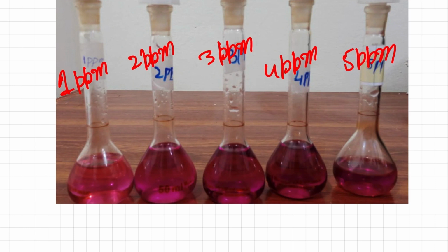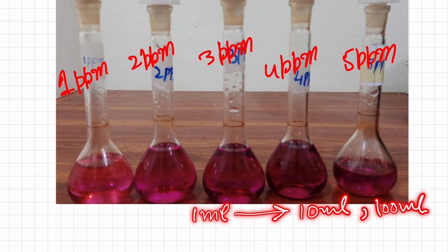You can perform the standard dilution method. In that method, you will take 1 ml from that unknown concentration solution and dilute it to 10 ml, or you can dilute it to 100 ml, so that it can lie in the range of your standards. Then you will perform your experiment.